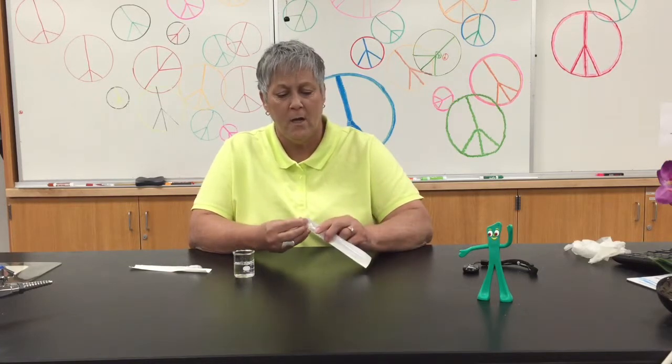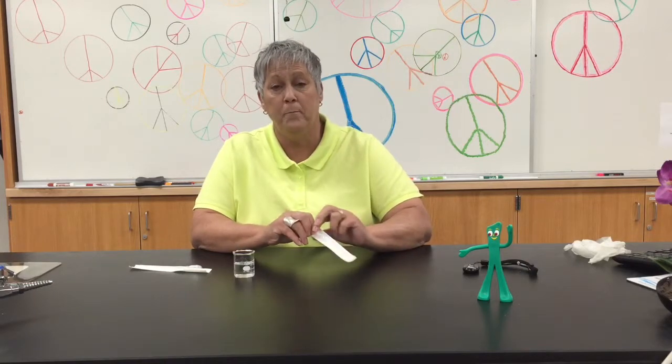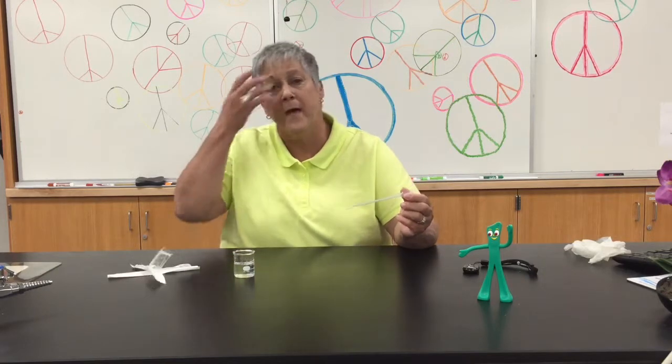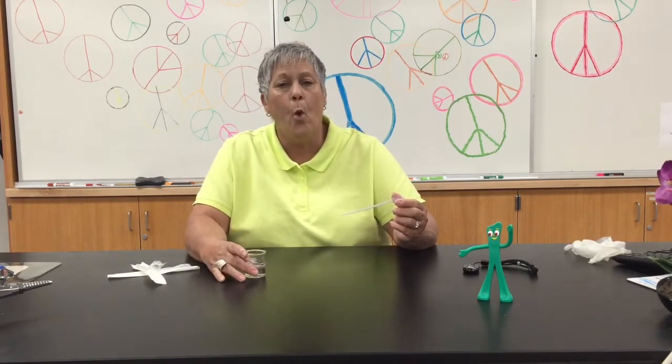Here we go, we've got a one mil pipette in this package. I would just open it at the end where the bulb is, just tear the package open, take the pipette out. I've just got a little bit of water in this beaker here to show you how this works.